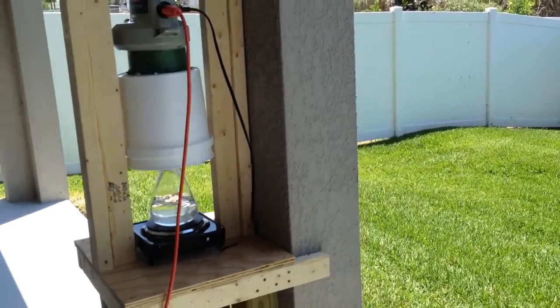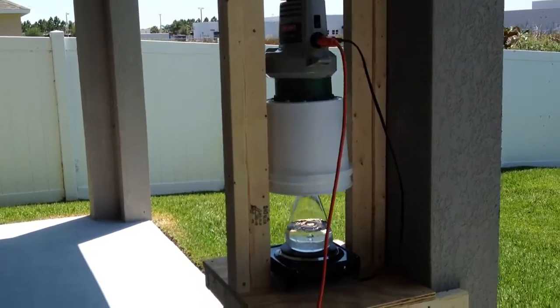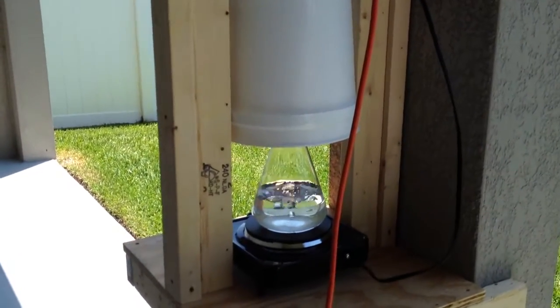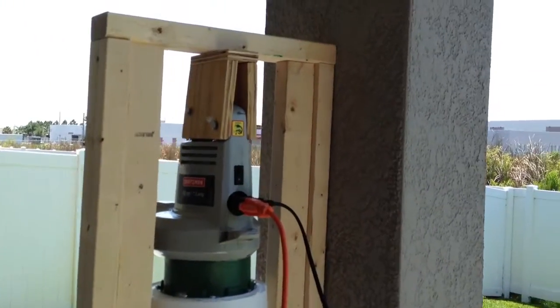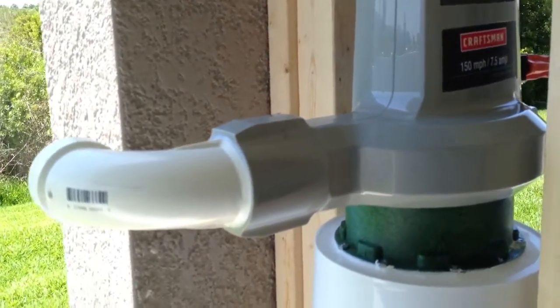So I built myself a rudimentary fume hood with some parts I had scattered around in my garage. This is water boiling right now, I'm just testing it. What it is, it's a high-powered leaf blower that I got at Goodwill for about five dollars, and I connected some PVC pipe over here. You can actually see some of the fumes coming out. I don't even have it turned on yet.